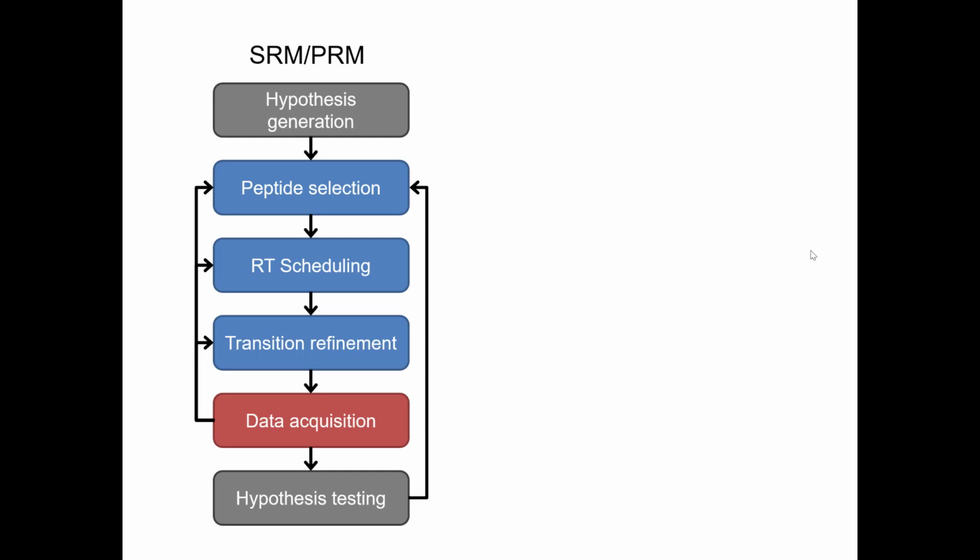And to build a quantitative assay, realistically with SRM, it takes months. We're talking about sitting down with the instrument for maybe 4 or 5 months to build an assay for a handful of peptides that is actually robust.